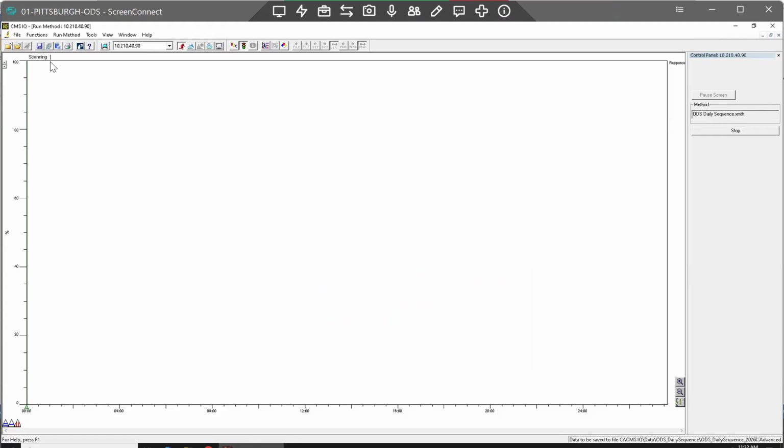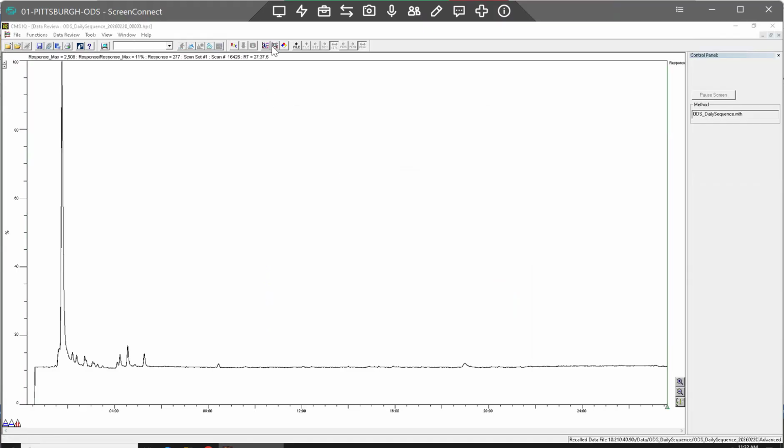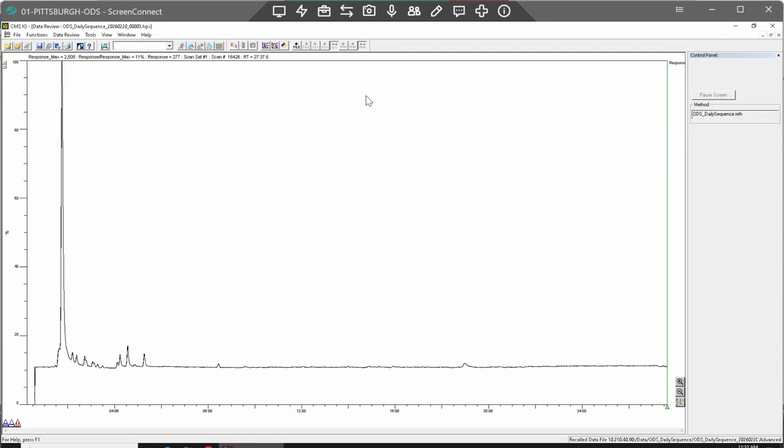Once that runs, when I pull up that file, if it was this one, I would go to your reports here, and then you can see your expected or predicted retention times. I remember that first one was 220. So obviously this is the file before. If the new one that I'm running right now, when I come back and check it in a bit, says 220, then I know it definitely has my calibration that I just did. But if it doesn't, then I did something wrong. But hopefully it's right, and we'll just go with that.